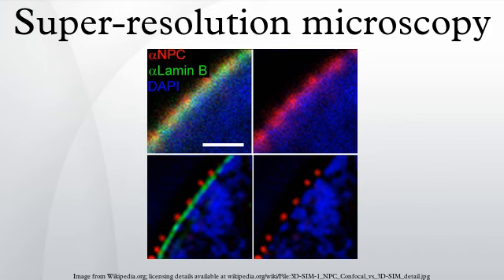In principle, any photoswitchable fluorophore can be used, and STORM has been demonstrated with a variety of different probes and labeling strategies. Using stochastic photoswitching of single fluorophores, such as Cy5, STORM can be performed with a single red laser excitation source.